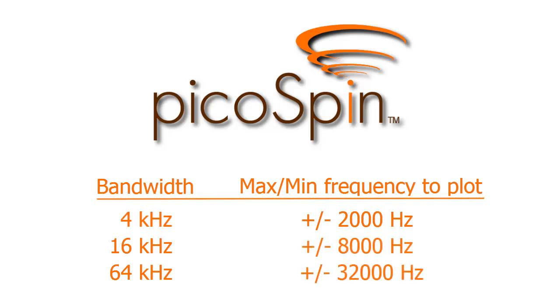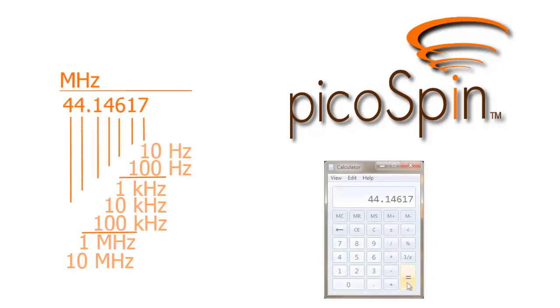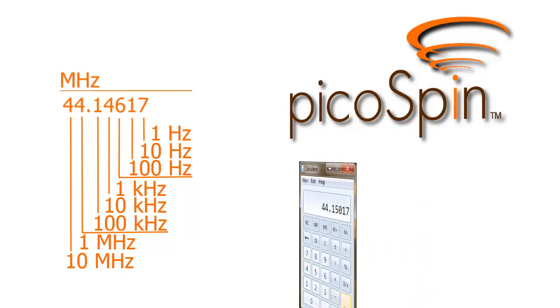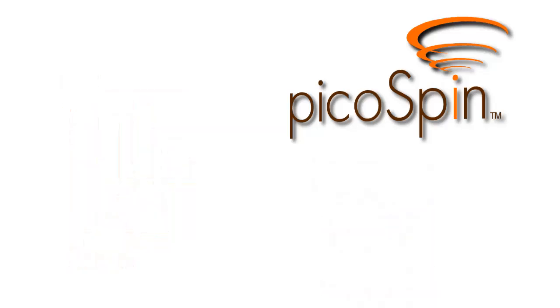We also learned how to adjust the transmit frequency in order to move the NMR signal within our spectral window. This will be something we find ourselves doing regularly whenever we use the PicoSpin spectrometer. In this video, we're going to look at the AutoShim script again, but this time we're going to use it to shim our instrument.